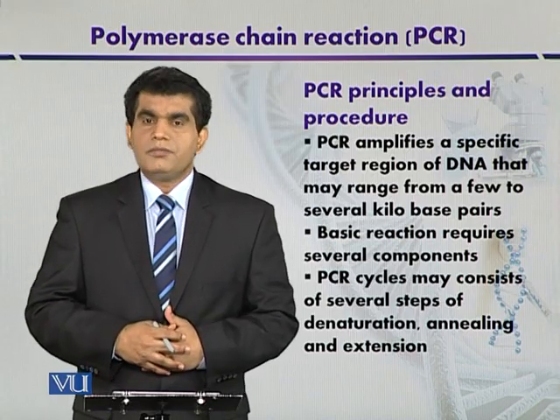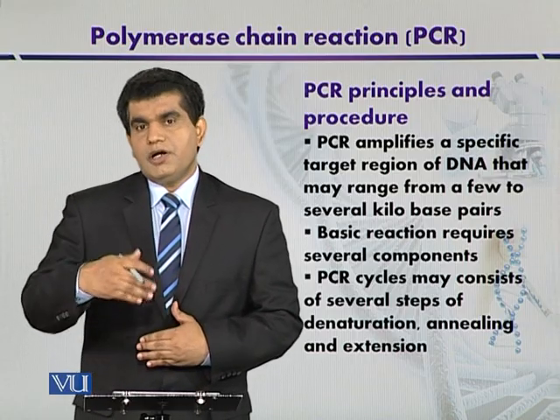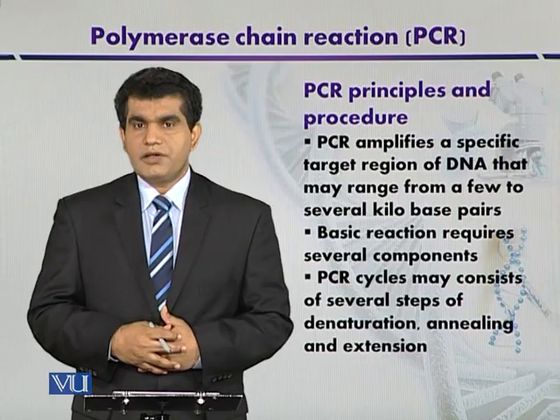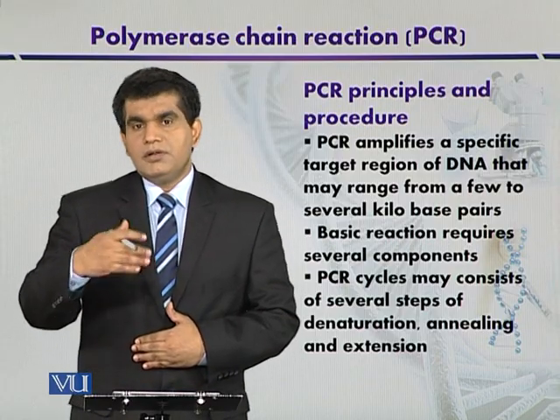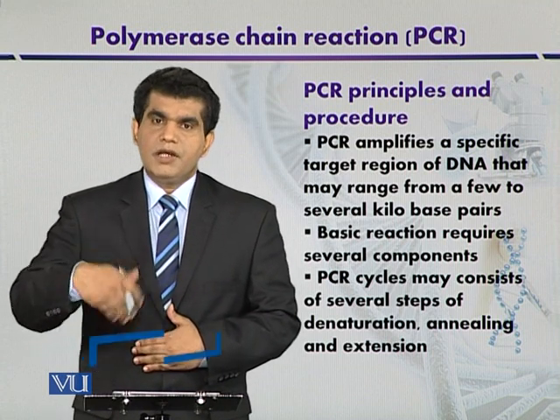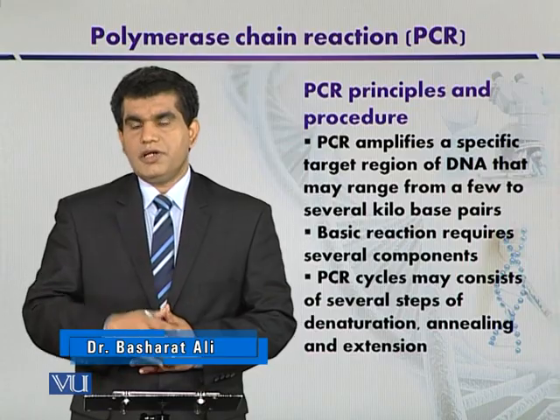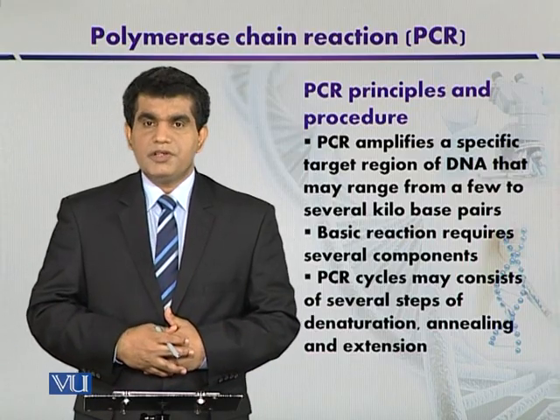And finally, the product that is accumulated, it may also be variable because it can be dependent upon the different factors of the reaction mixture, like what may be the concentration of the template DNA, and especially with reference to Taq DNA polymerases, concentration of dNTPs, and temperature that we have used during the different steps of the PCR.